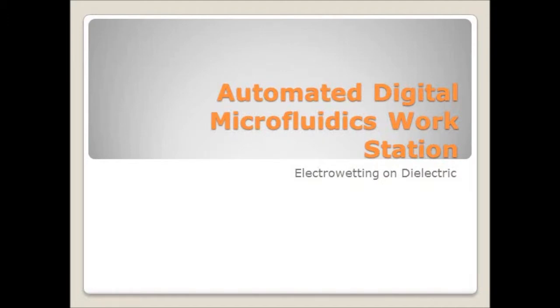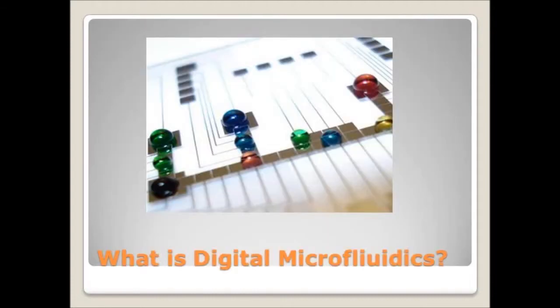We are Group 19, and we're doing an automated digital microfluidics workstation that uses the principle of electrowetting on dielectric. Digital microfluidics is a technology for lab-on-a-chip systems based upon the manipulation of discrete droplets by transporting, mixing, and storing fluids using a standard set of basic instructions.